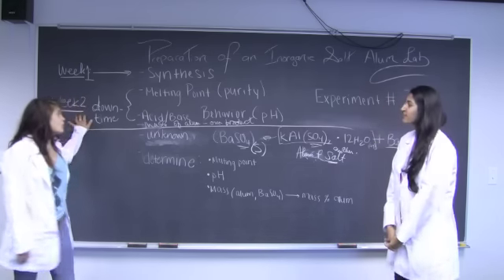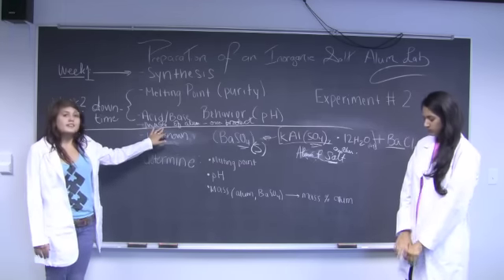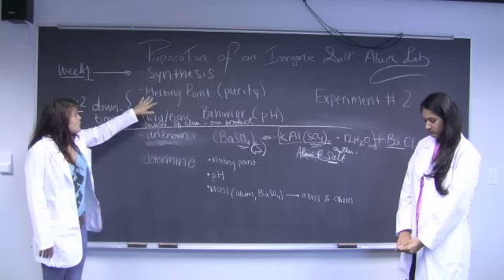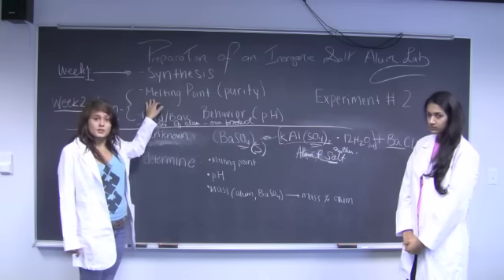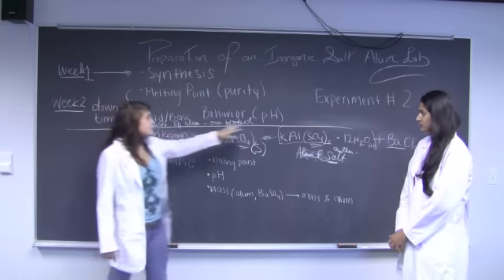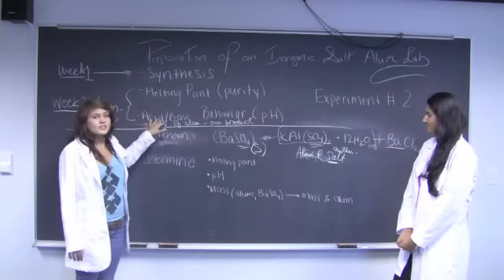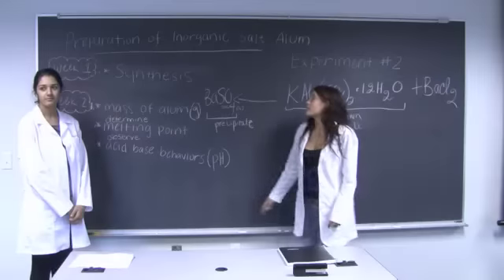In week 2, we're going to take the mass of our alum that we created in week 1 and test its chemical properties. We're going to test its melting point to determine its purity, and we're also going to test its pH by dissolving the alum in water and determining its acid or base behavior.